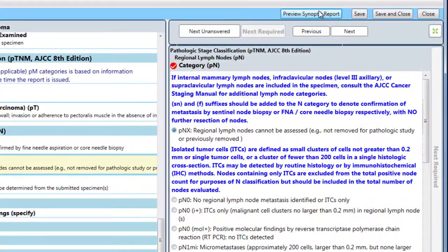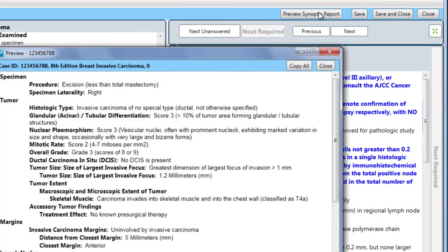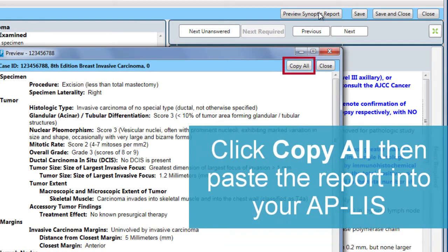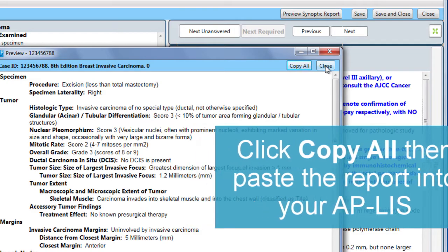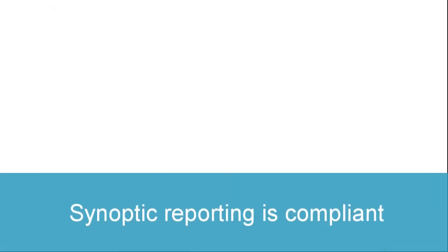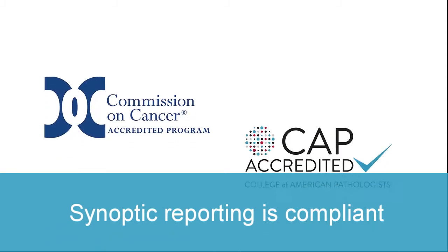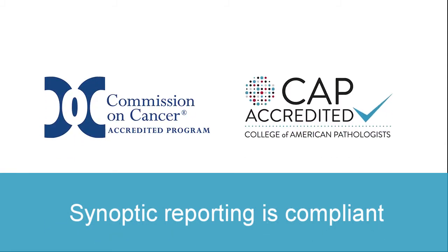If you're using the stand-alone version of E-Form, you can easily copy and paste a complete report summary into your LIS. The synoptic format complies with accreditation requirements of the American College of Surgeons' Commission on Cancer and the CAP.